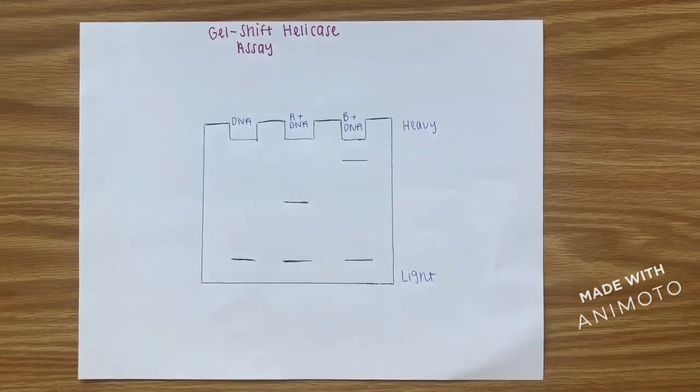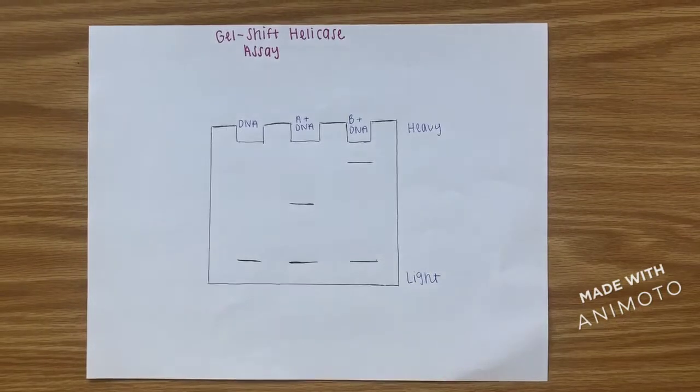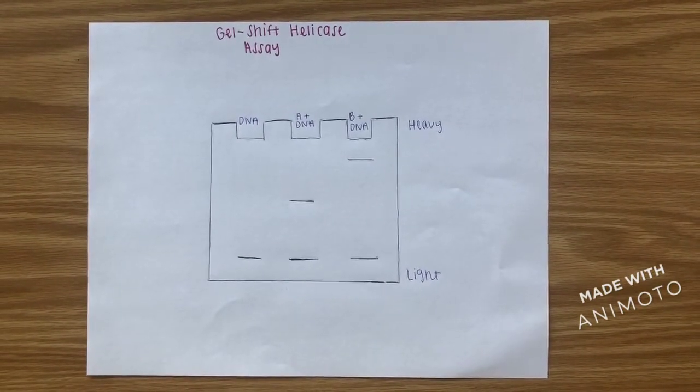Imagine a small mouse running through the gel. Now imagine a large elephant running through the gel. Who is going to get through the gel faster? The mouse, which is why the lighter molecules are on the bottom.